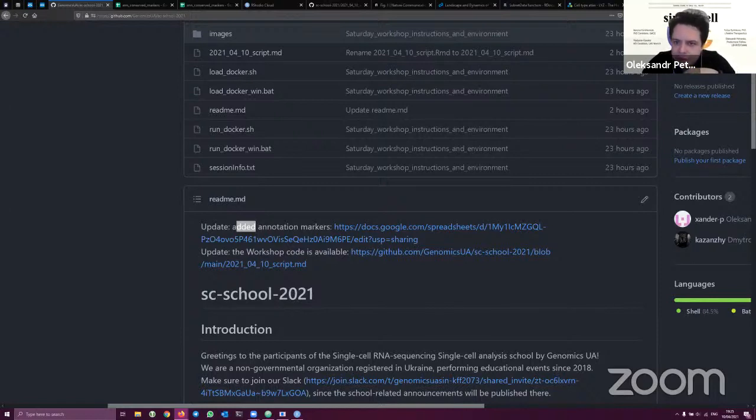Okay, so there was one of the questions regarding the PCA. Why do PCA before UMAP? Does it override itself or not? No. The PCA is an initial reduction, which is important to pass to the UMAP. So UMAP will use it as an input. So no, it's not overwriting itself. It's just different steps of this analysis. Okay, so one question answered.